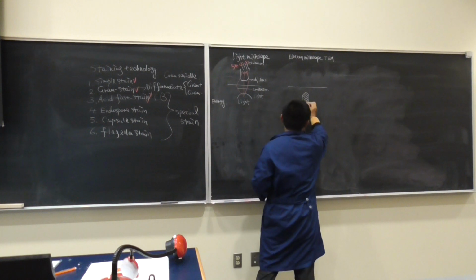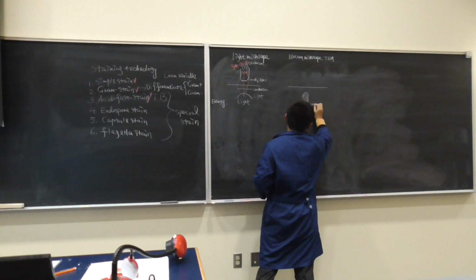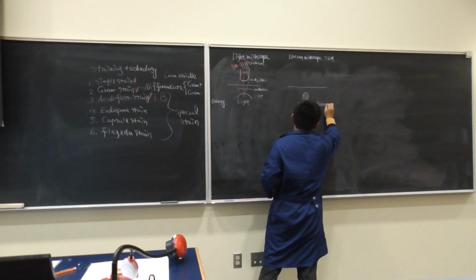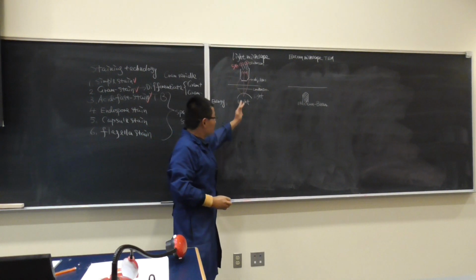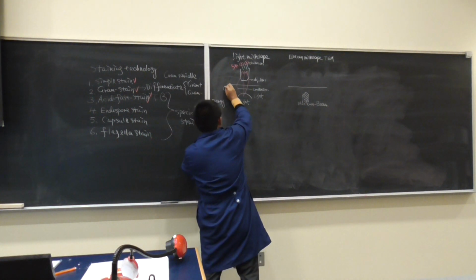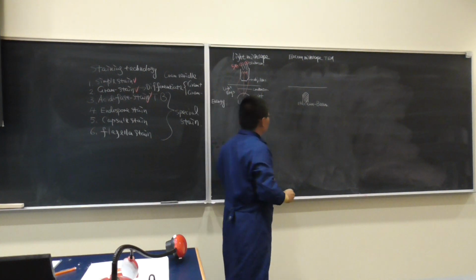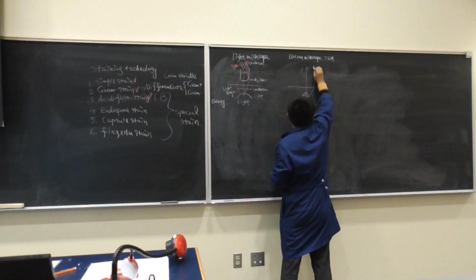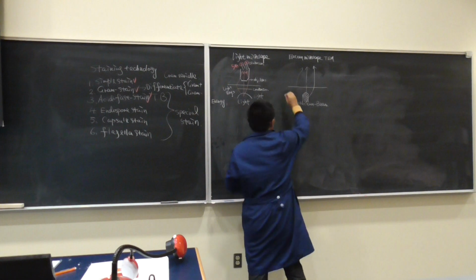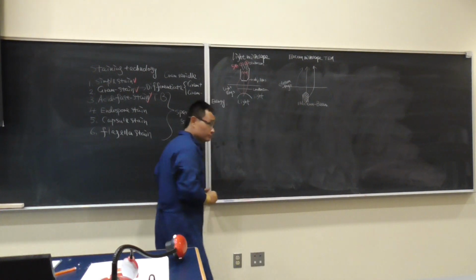So what is it called? It is the electron beam. So, light microscope, you have those light rays come out. An electron microscope, you're going to come out with what? Electron rays. That's easy to understand. That's the first thing.